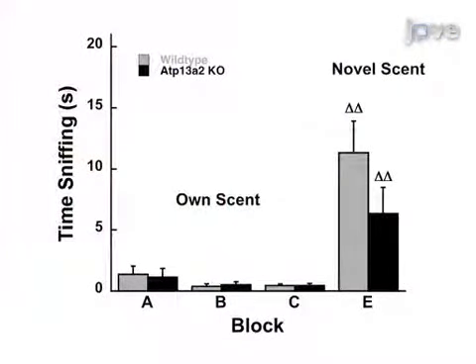Ultimately, these tests can be used to measure the olfactory abilities in genetic mouse models of neurodegenerative disease and in clinical drug studies to test potential therapies.